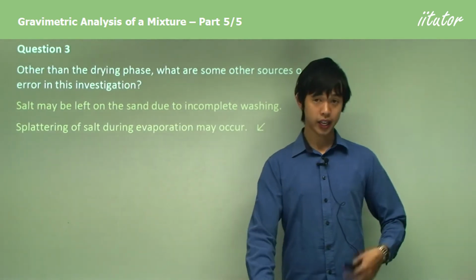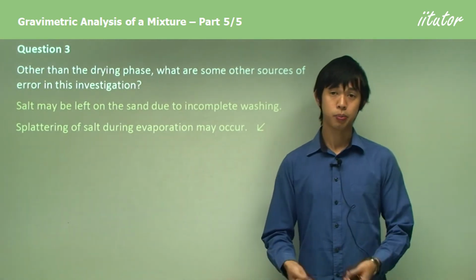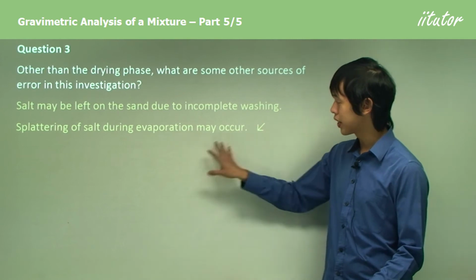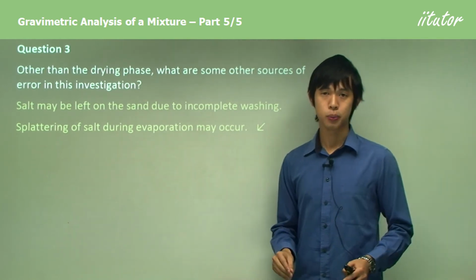And again, someone might get a little bit over-enthusiastic about the boiling process. Salt splatter is another source of error. This one we can reduce a lot, right? Because we just say, look, don't splatter the salt.